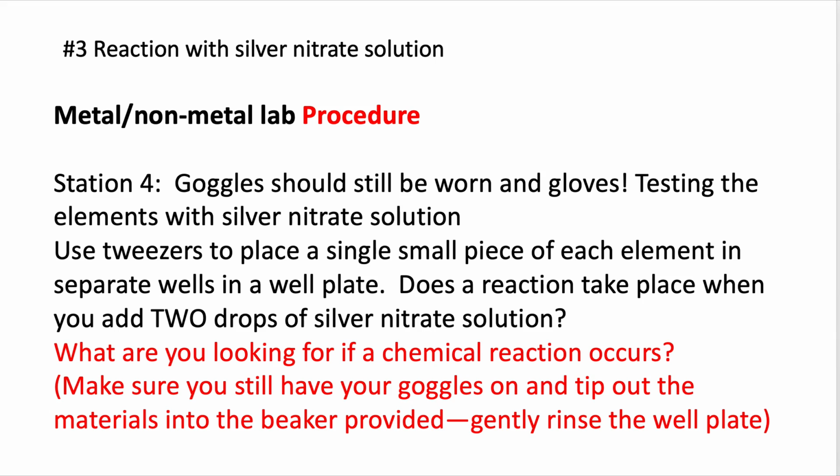The final station is react with silver nitrate solution. You can use copper sulfate solution as well. Goggles, gloves, and care with the cleanup again. Tipping all the liquid out and rinsing carefully actually into the beaker with a distilled water bottle.